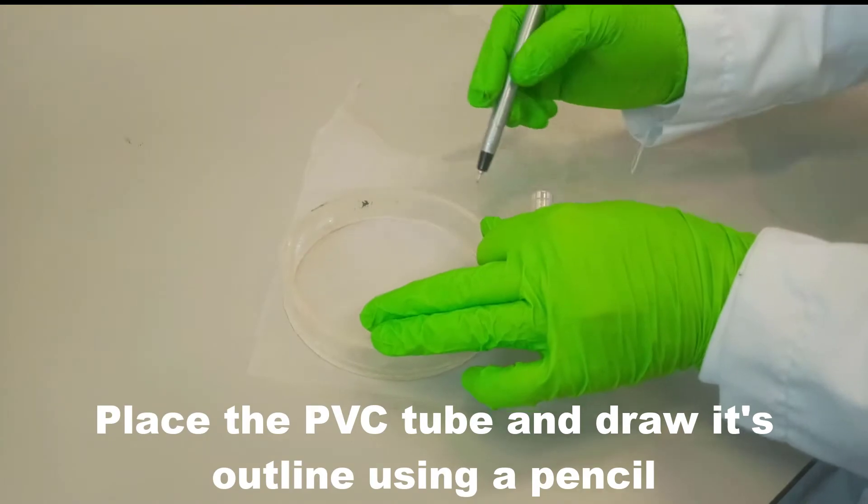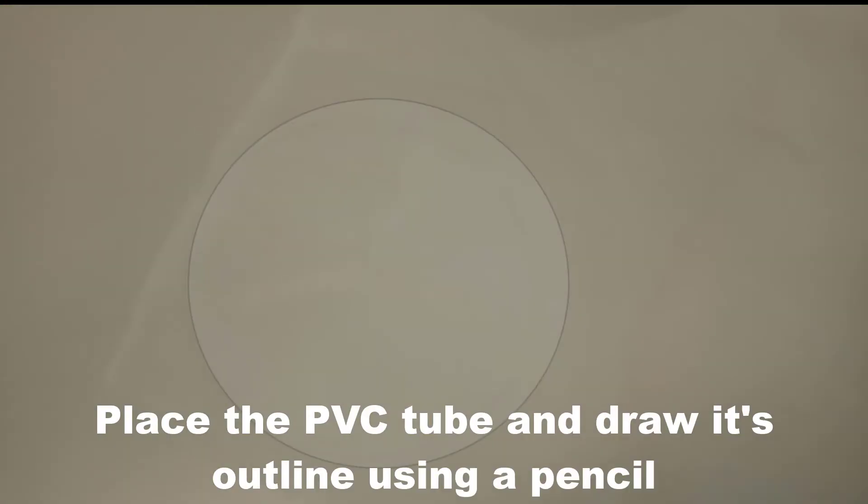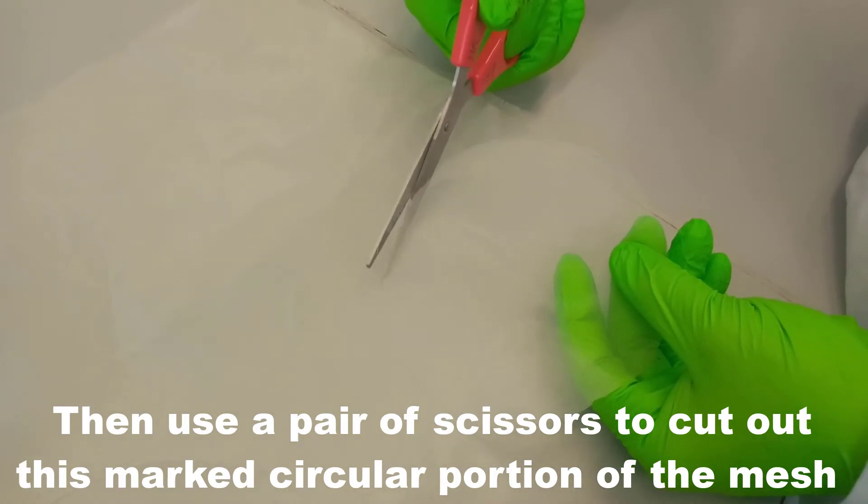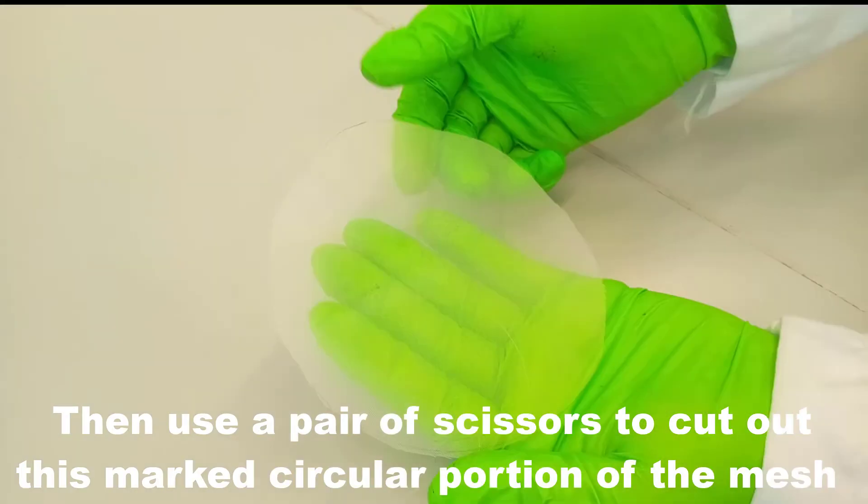Place the PVC tube on the mesh and draw its outline using a pencil. Then use a pair of scissors to cut out this marked circular portion of the mesh.